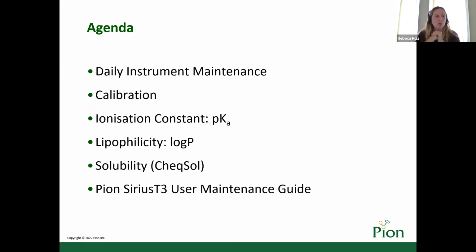It will follow a close review of the PhysChem measurements, pKa, log P, and solubility, including experiment design and quality of the data obtained for every T3 technique. The webinar will finish with a quick look at the Pion Sirius T3 user maintenance guide.